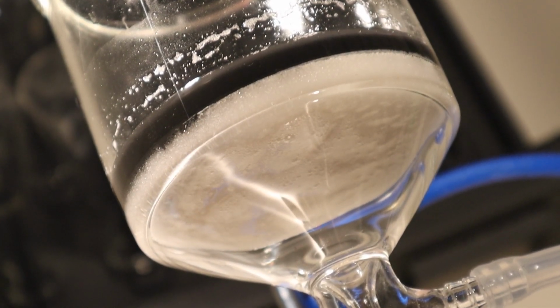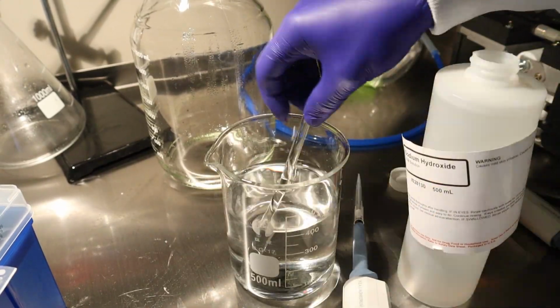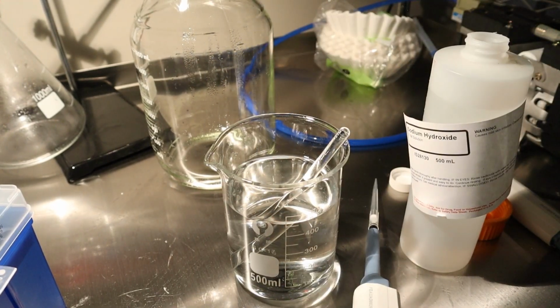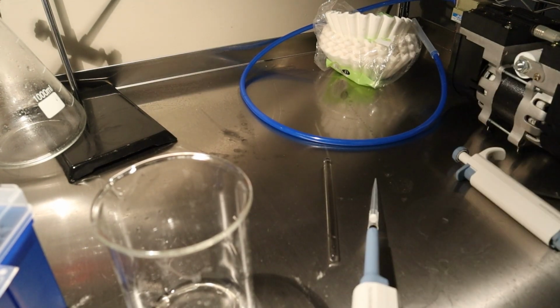The next step was to neutralize the solution to pH 6 with sodium hydroxide, which after painfully doing for a while and adding over 100 mils, I realized my sodium hydroxide was incredibly dilute, and I had to put the eluate in a bottle in my fridge so I could order some sodium hydroxide to make a more concentrated solution.